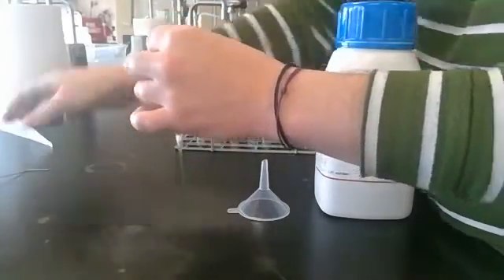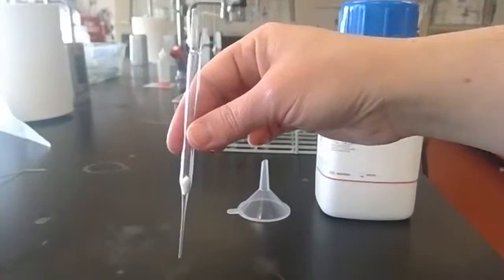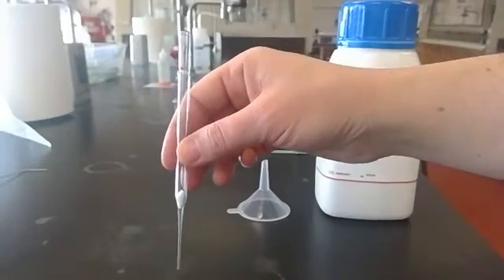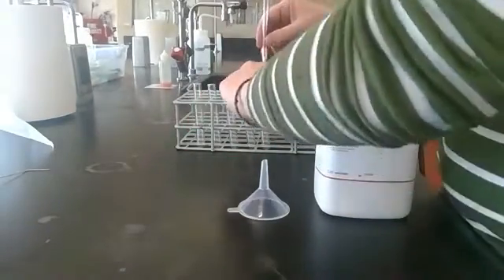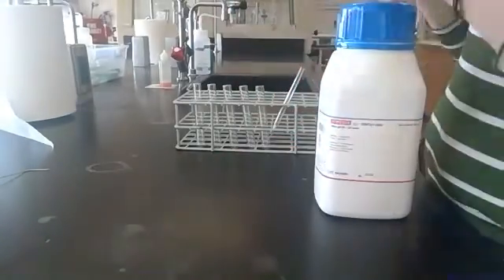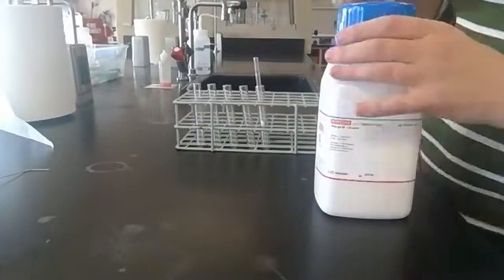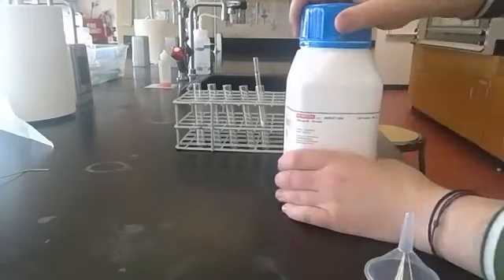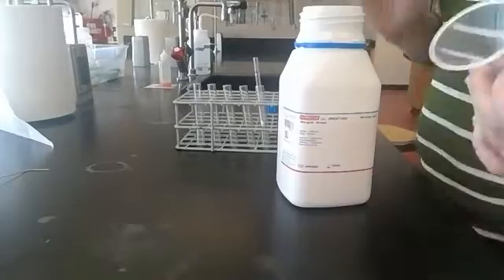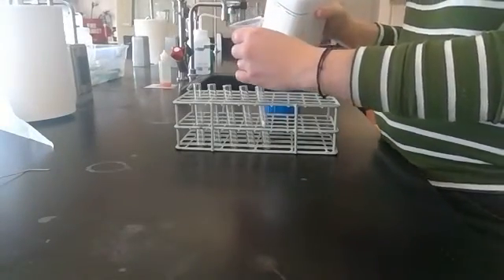All right. So here I have my column with a little bit of cotton. Now I'm going to fill my column with my stationary phase. That is going to be my silica gel. So I'm going to kind of set this here. I'm going to use a funnel. I'm going to set this in here just to stabilize it. What I have is silica gel that's a 60 to 120 mesh. This is really just a very fine grained silica that's like a powder.